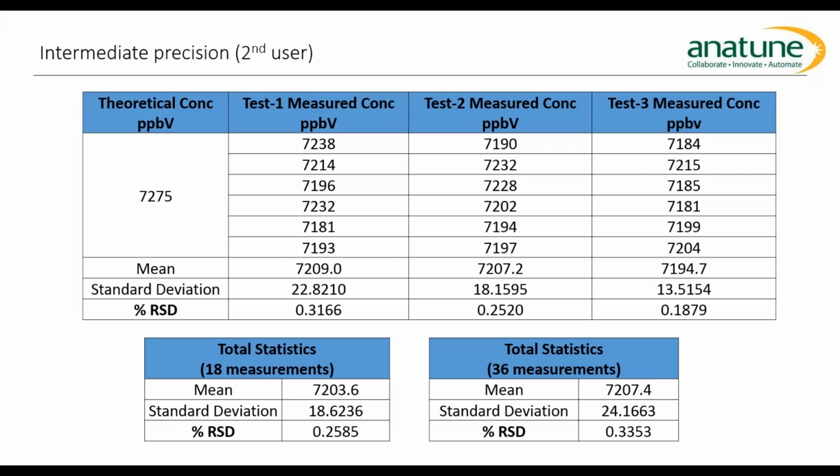If you take the total statistics, 36 measurements altogether, RSDs of 0.3% for 36 measurements of formaldehyde measured in the gas phase with no internal standard. Again, I challenge any other methodology to hit those sorts of precise measurements. So a tick in the box for intermediate precision.